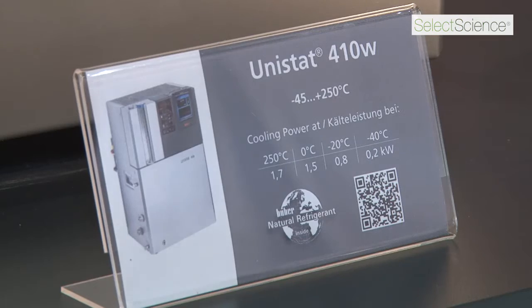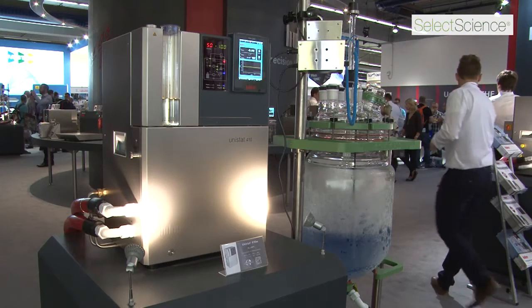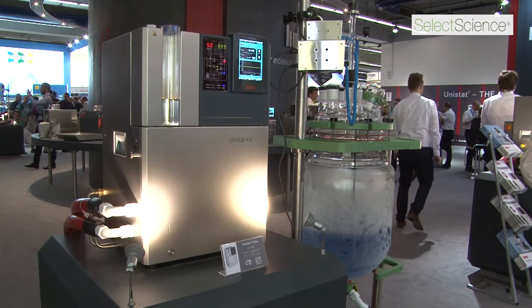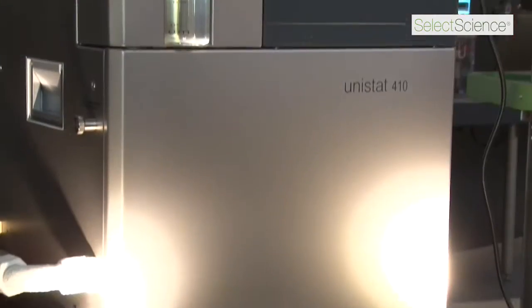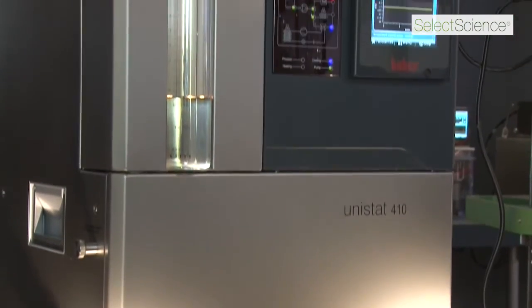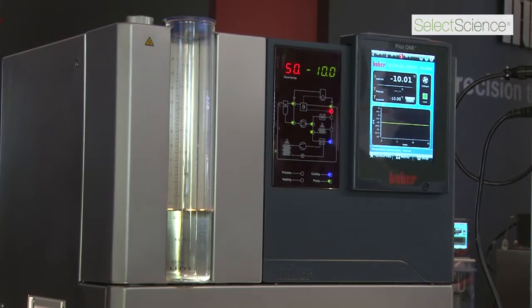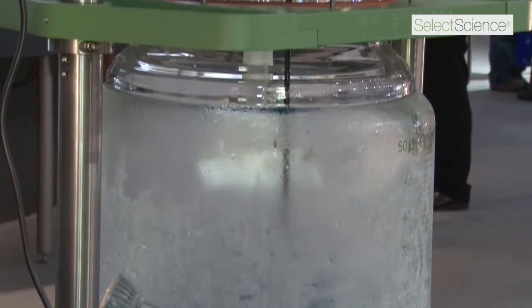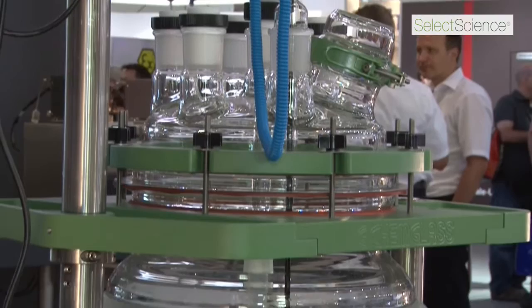The Unistat 410W is a small benchtop unit but with a lot of punch. It's a water-cooled unit, which means we can have a smaller condenser, which obviously contributes to its small size, but as we can see here it really does control a rather large reactor for its size.